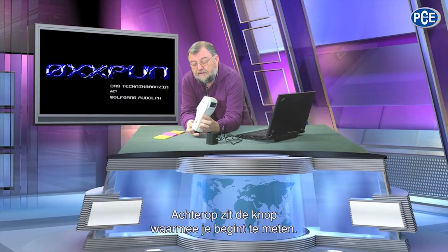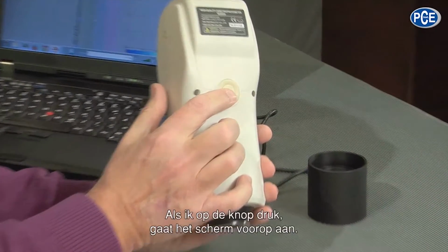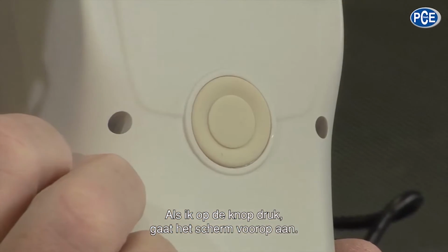So when we look at it, it is a hand device, actually for usage with one hand. Here at the back is the trigger with which I start my measurements, and when I have it in my hand and push on it, then I get my display at the front.